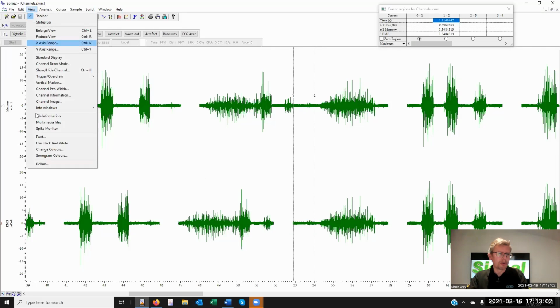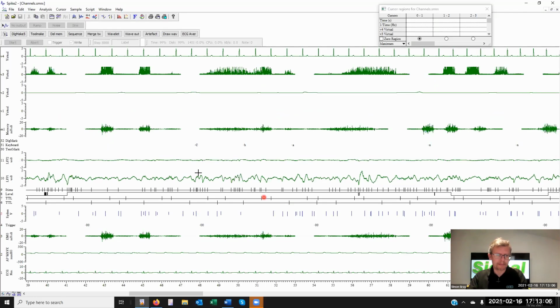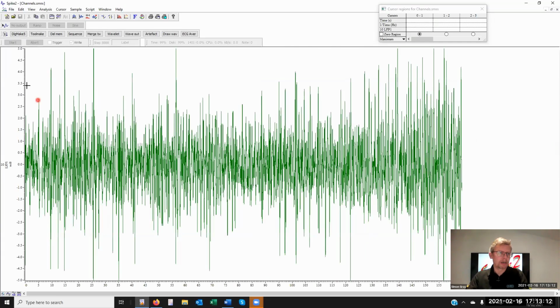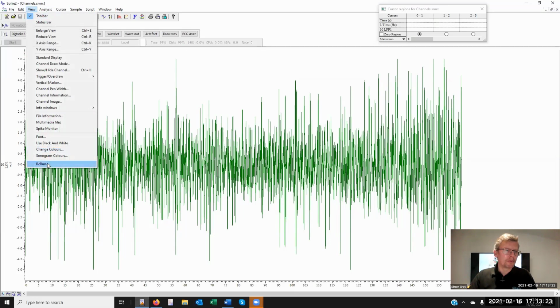Show standard display. Okay, let's look at LFP this time. So this goes on for a while. Okay, so 160 odd seconds. That should give me plenty of time. Right, let's rerun this guy. View, rerun.